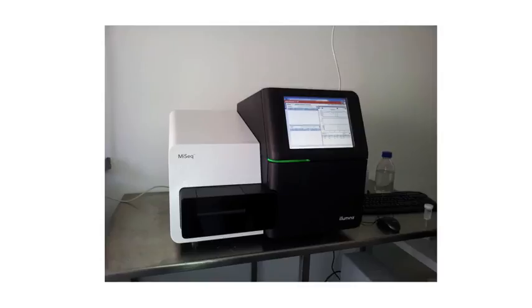Because there are so many microbes in a community, tens of thousands of sequences must be generated for each sample to thoroughly describe all of the microbes. High-throughput sequencing allows us to do this process for lots of copies of DNA for lots of samples all at once. This is one of the high-throughput sequencers we use in the lab.